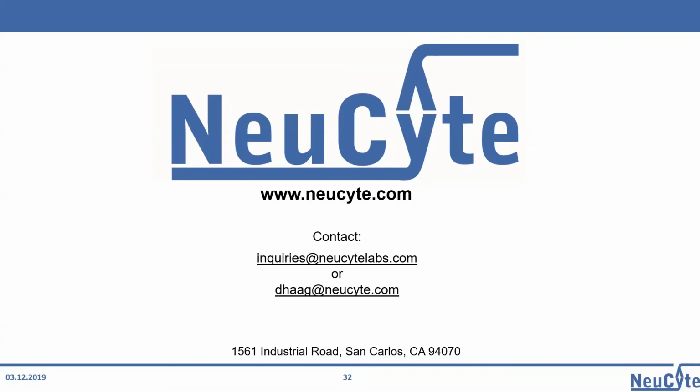And are you planning on developing other neuronal type cells such as dopaminergic neurons or astrocytes in the future? Yes, there's a lot in the pipeline. Unfortunately, we're not that big, so we cannot prioritize all of the projects at the same time. At the moment, we are most advanced with induced astrocytes, and we're running beta tests on the implementation on the platform and the functionality of the developing networks in comparison to the standard culture that I have shown the data from. So I would assume that the next to come online will be induced astrocytes, so that we would have isogenic cultures from the same donor, even including the astrocytic component. Other neuronal cell types are indeed in the pipeline, but they will probably take a little bit longer until this is ready to be given out for testing.